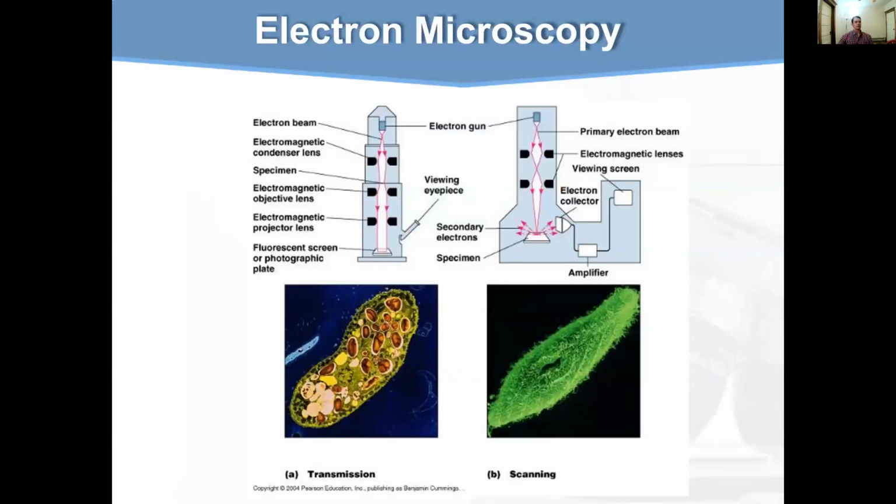Okay, now moving on to electron microscopy. I'm not going to go into too great detail here or the technical details. If you are interested in that, please feel free to have a look at your textbooks, but I feel it's a bit above and beyond because you're also not going to be working with these. Just what I want you to know from this is that there are two types of electron microscopes.